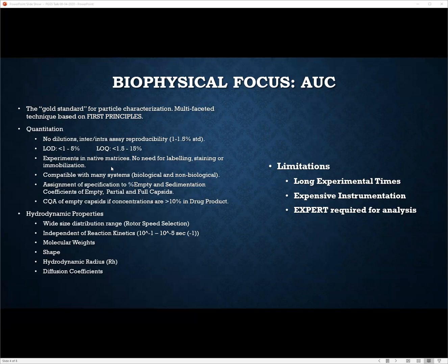Actually, you have to know what you're doing, because the programs that are used to solve for the equations that in turn give you the model of the data are complicated. And this is something that is plaguing the field, but I believe, and I'm seeing right now, a resurgence of the AUC, which also correlates to a resurgence in the education. So this expert requirement is going to be phased out in a short time.